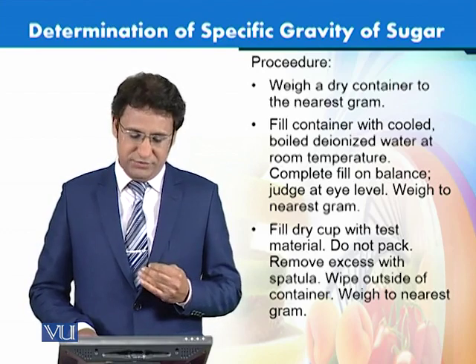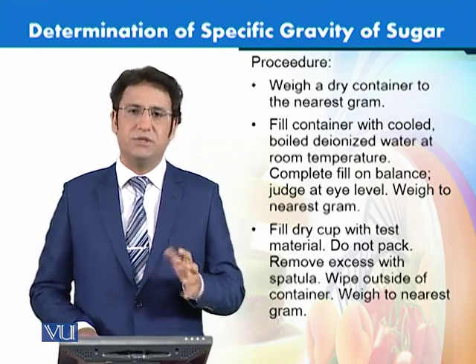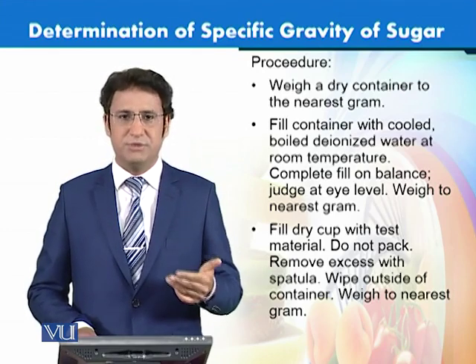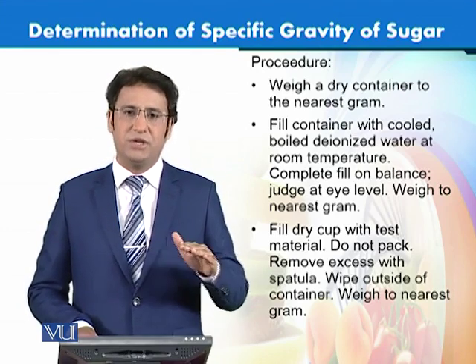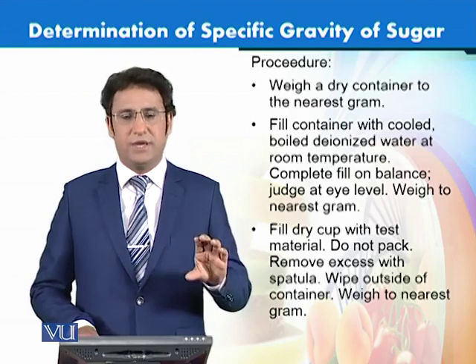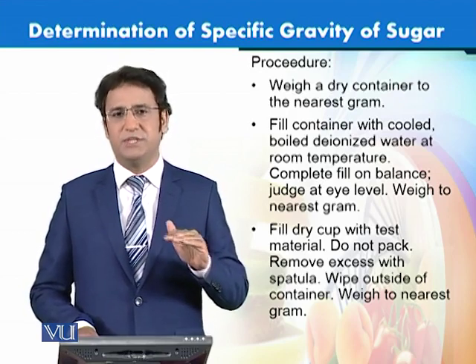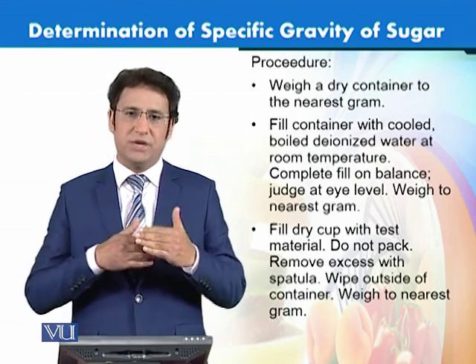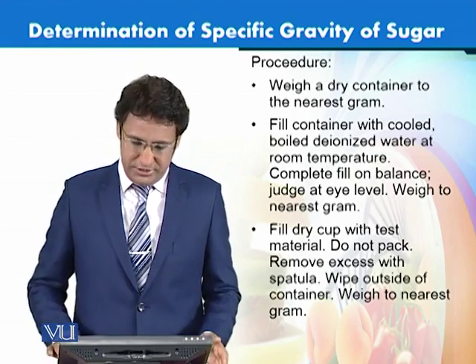Then the second thing is we fill this dry cup with the test material. Now we'll use the same cup, and we would use the test material. Again, we would be very careful to measure the exact grams of weight, and it must have a proper fill. It should have the same fill as we had for the water, so that an actual comparison can be made.